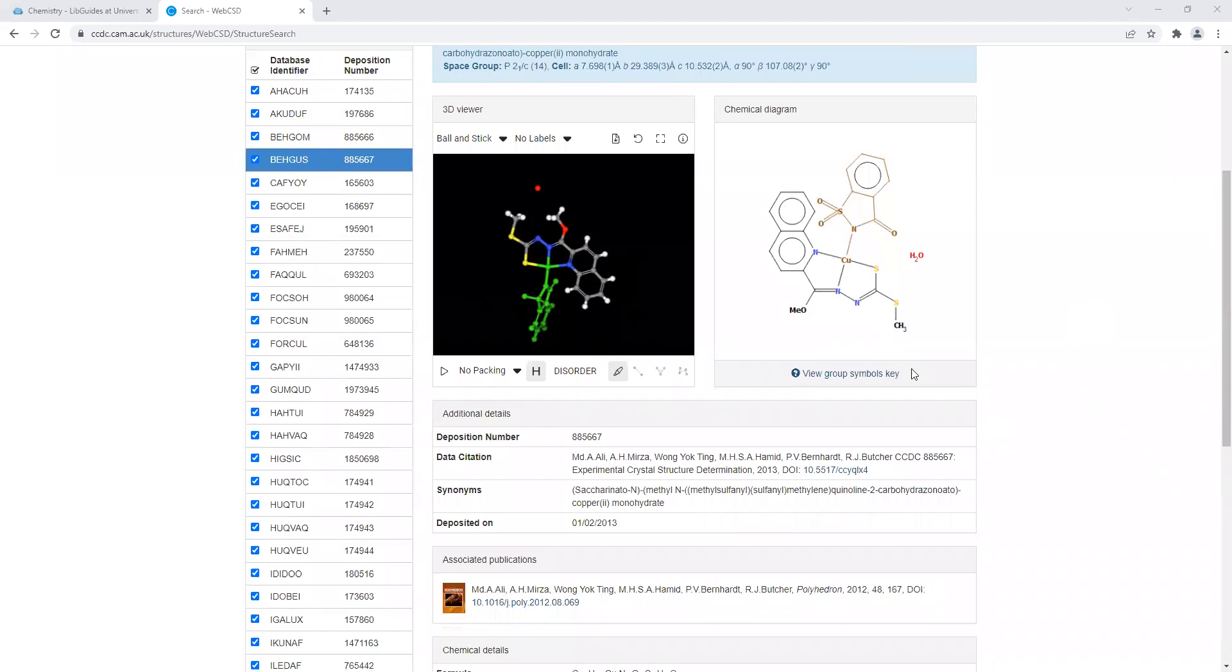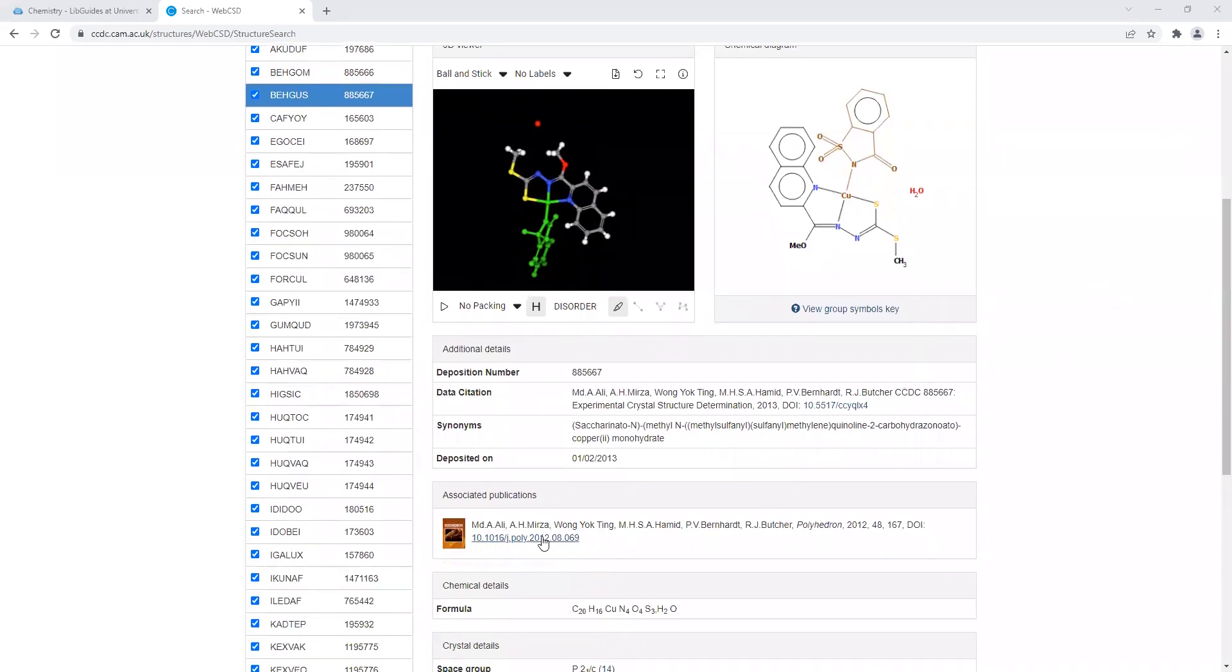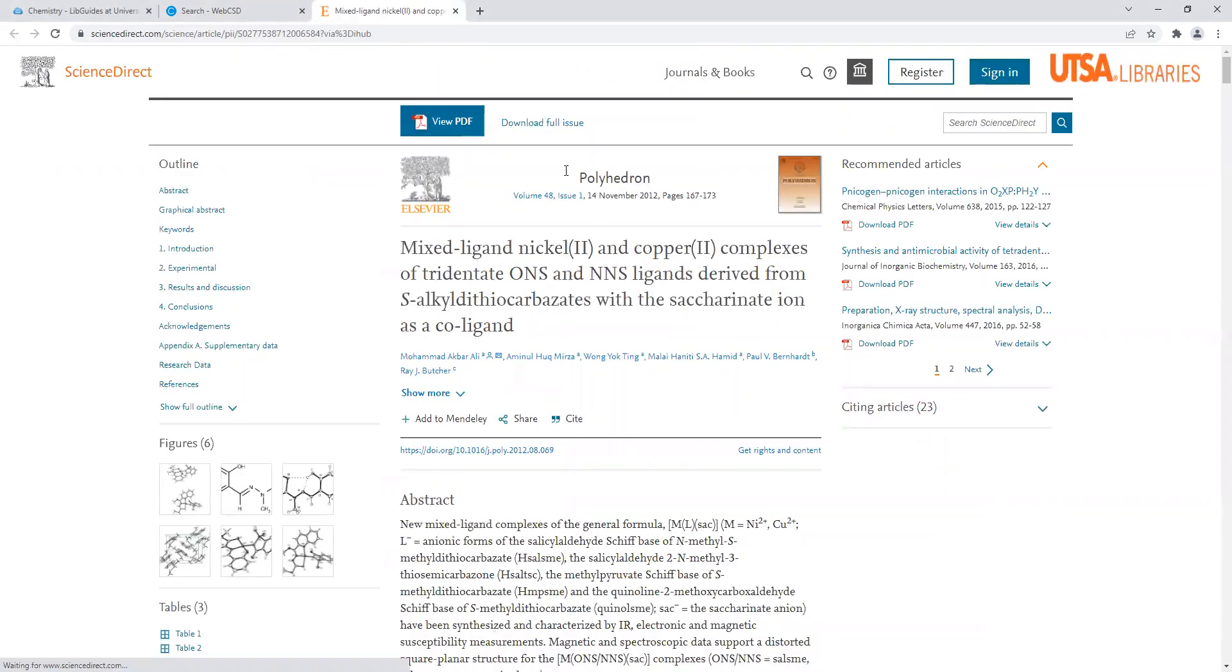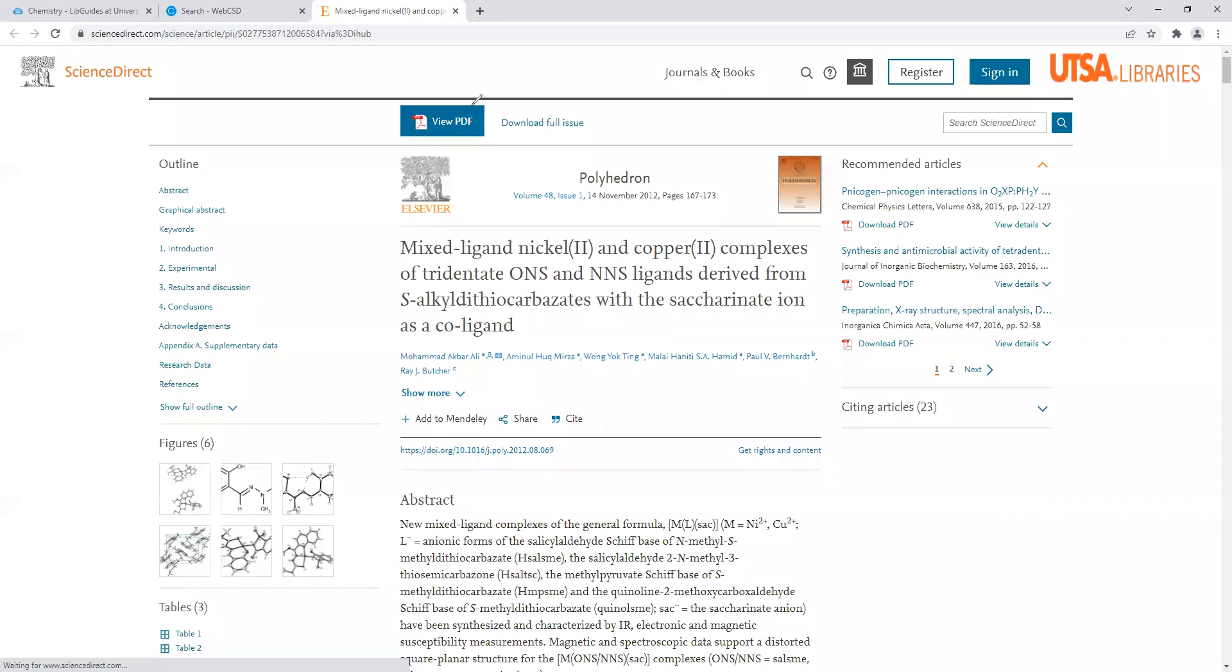Again, your TA will assign you your metal to research. If you want to use this structure, you come down here to where it says associated publications. You click on the DOI link and it'll pop up the paper. If our university has access to this journal, when you view PDF, you'll be able to download it here.